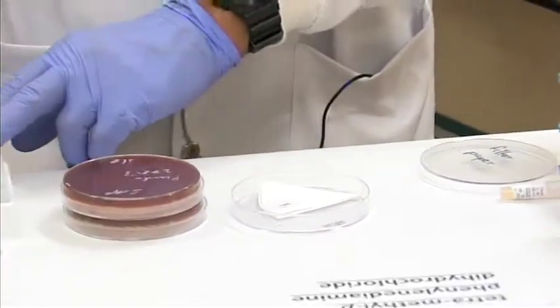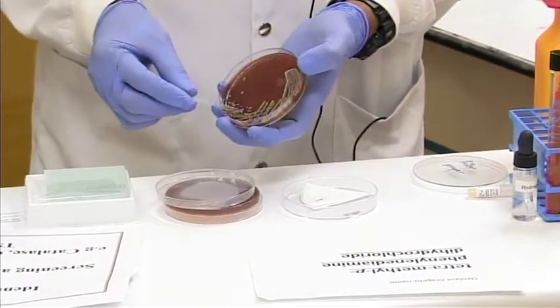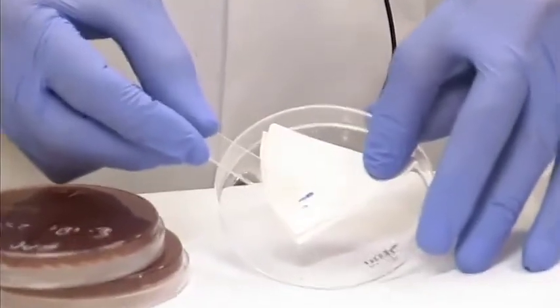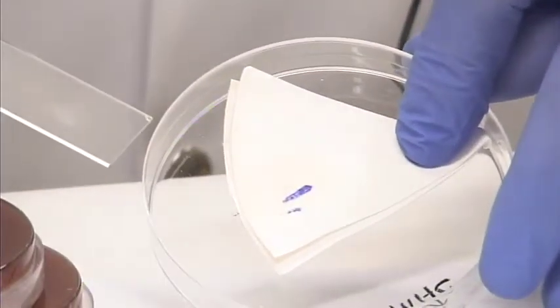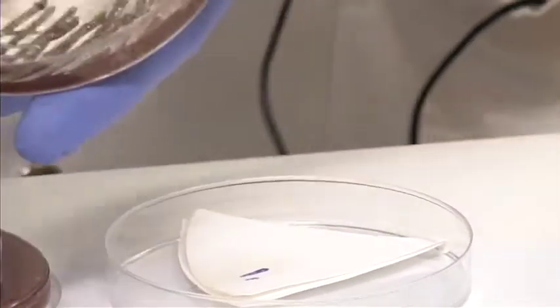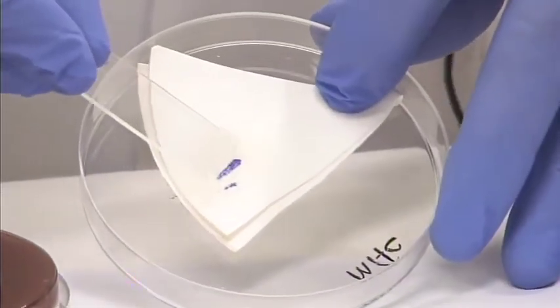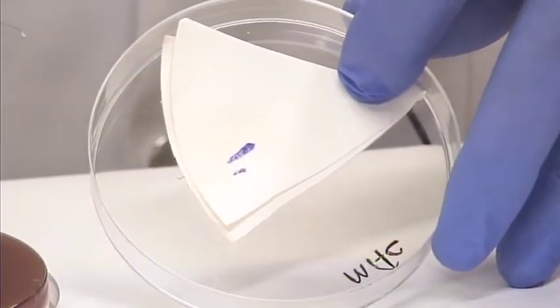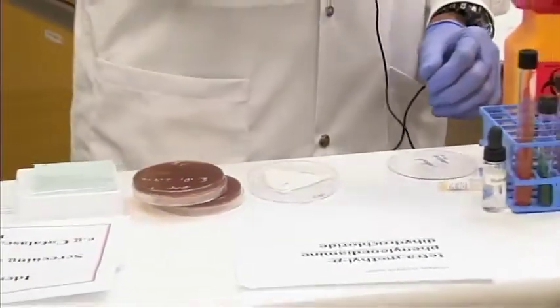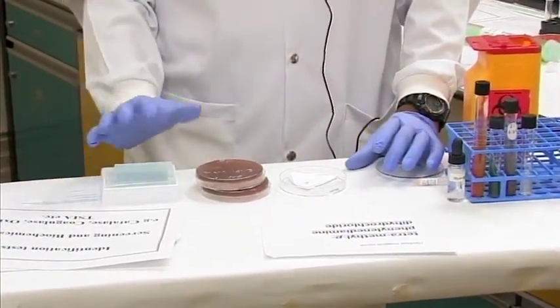Now we're going to do a negative reaction, a different bacteria here. Here we have E. coli. I can smear it onto another spot of the filter paper, and you see no reaction taking place there, no color end product. Again, I'll repeat that for your E. coli. Pick up some bacteria, smear it onto a different portion of the filter paper that is wet with the reagent, and you have no reaction taking place. So to summarize for this oxidase test, a positive reaction is given by Pseudomonas aeruginosa and negative by E. coli.